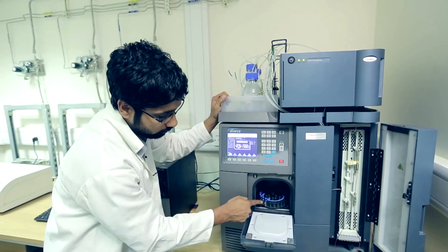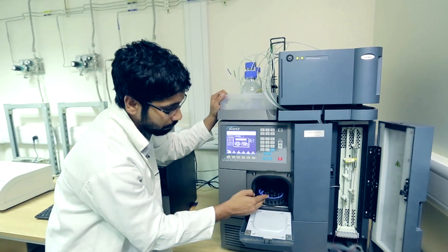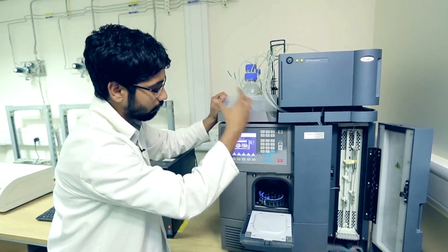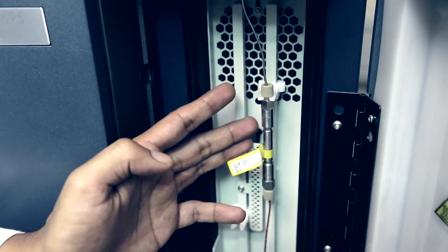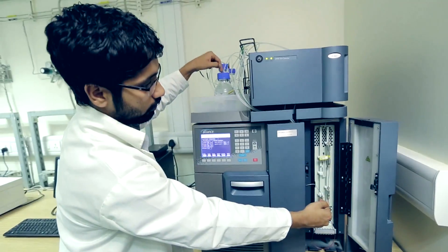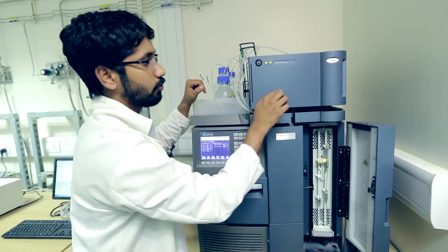Here injectors are placed. What it does is it takes the sample from the vials kept in the sample tray, and then by mixing of solvents, it goes through here. This is, you can see, this is the solid phase. From here the solvents are coming, the solvent is passing through the sample, and it goes directly to the detector.